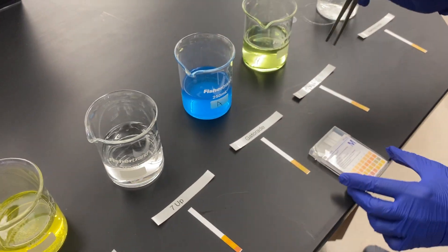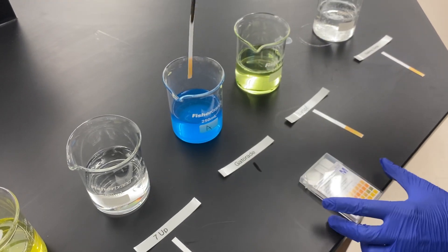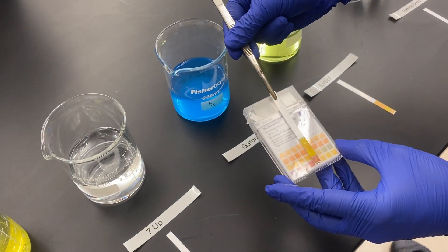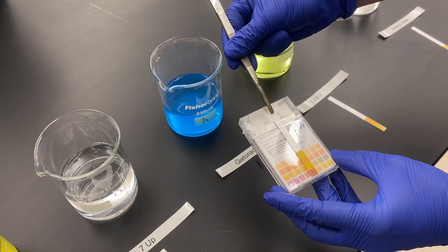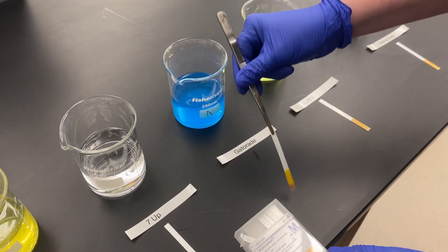Next we have an electrolytic solution — Gatorade. This is the blue Gatorade option. This is also generally acidic, about a pH of 3 or so, making it also a pretty acidic solution.